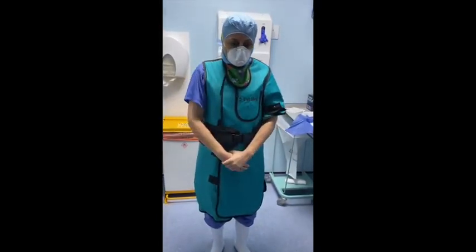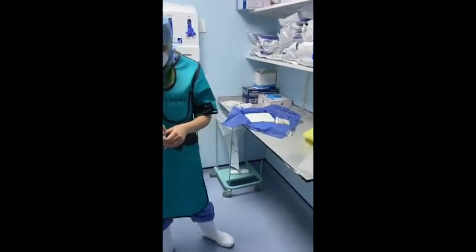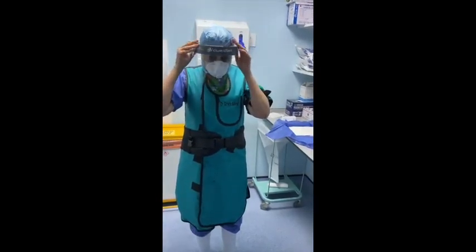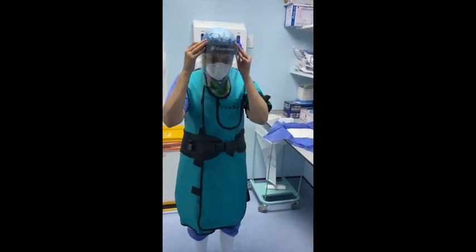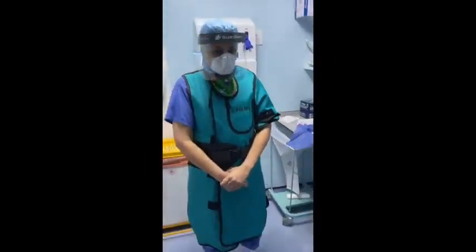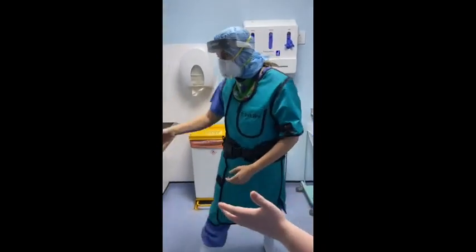And then the last thing that you need to pop on your head is your visor. Now the visor is an elasticated fastening, just like so. Now at this point, just before we proceed, adjust your headgear as comfortably as you think you need it during the procedure, because after this you will not be able to touch your head at all. So the next step is we'll wash our hands.